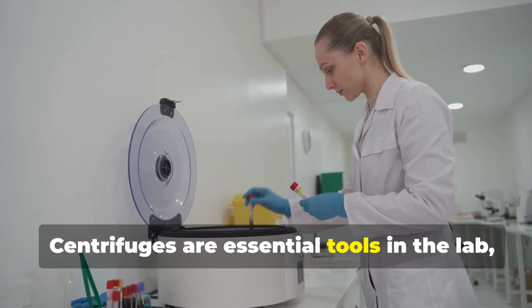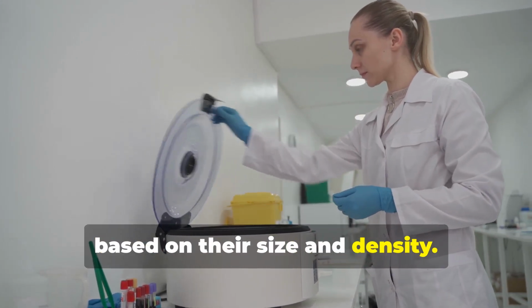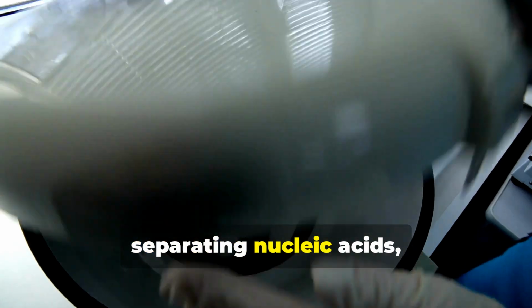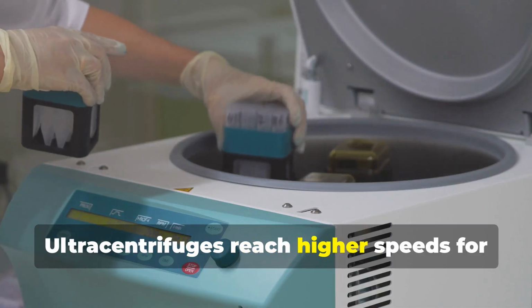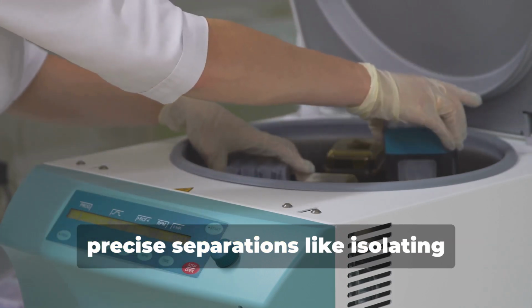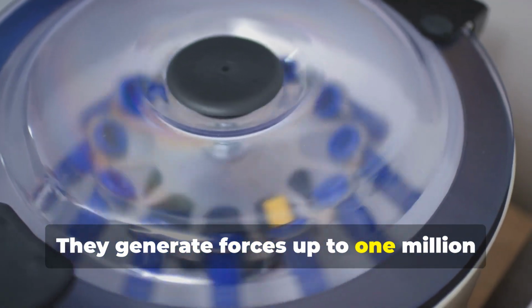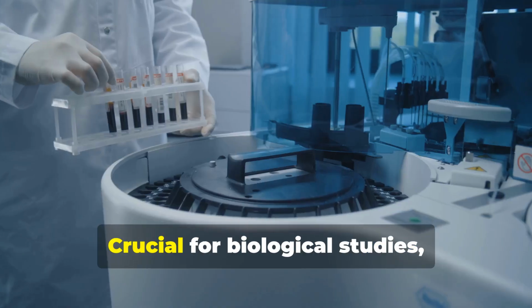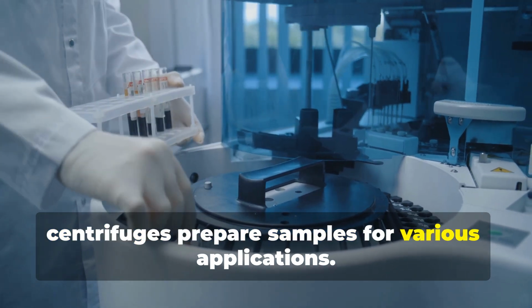Centrifuges are essential tools in the lab, used to separate cellular components based on their size and density. Microcentrifuges process small volumes, separating nucleic acids, proteins, and other components. Ultracentrifuges reach higher speeds for precise separations like isolating organelles and viruses. They generate forces up to 1 million times gravity, enabling fine separations. Crucial for biological studies, centrifuges prepare samples for various applications.